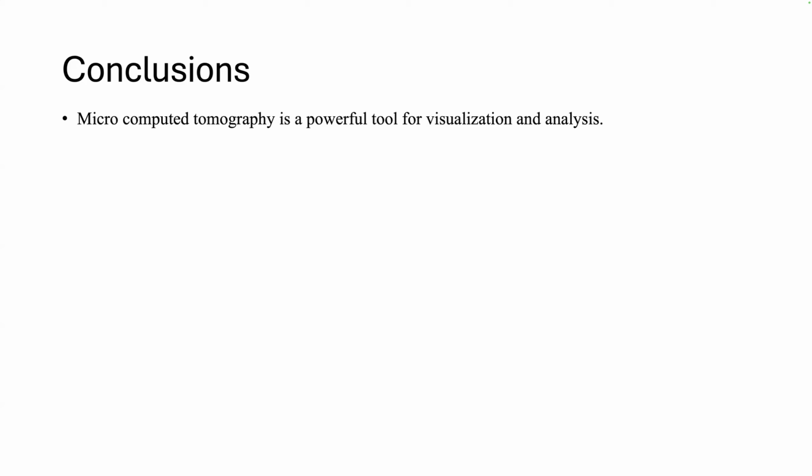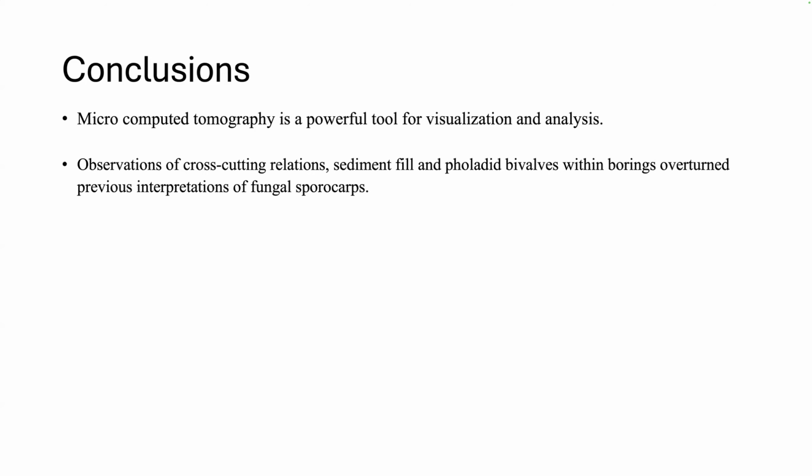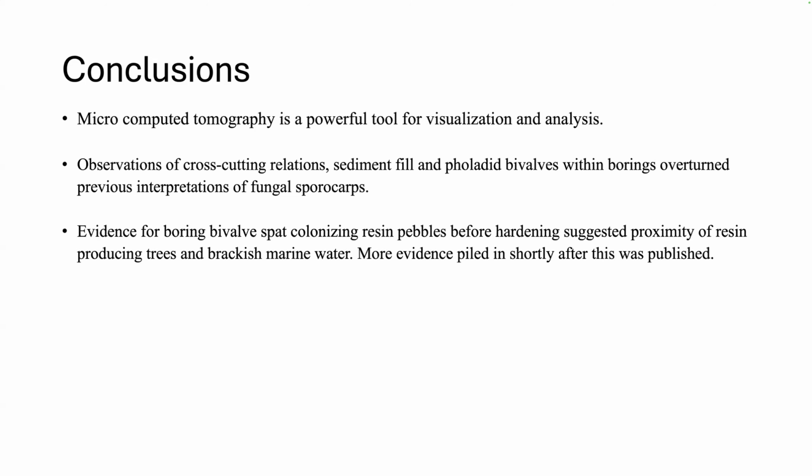So you can see in 3D, you can pick any viewing angle and you can measure anything you want. And what we saw the weekend before last was you can also scale up and export and print objects that you're interested in. And this was the story of the pholads, cross-cutting relationships, sediment fill, the fossils actually within the borings, and that overturned that. So this one actually overturned the previous interpretation.